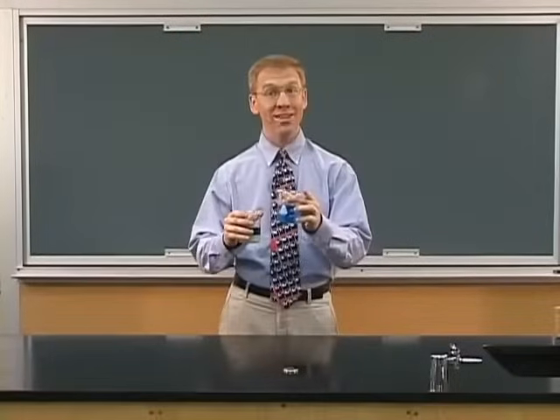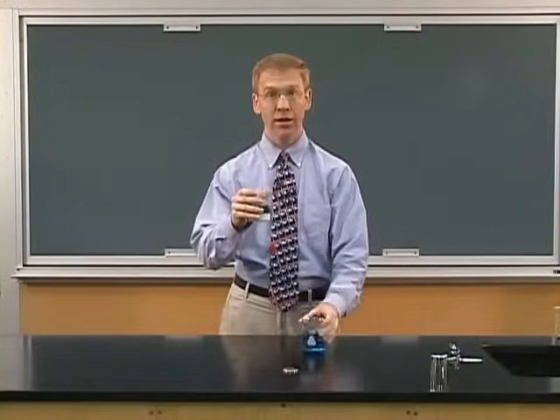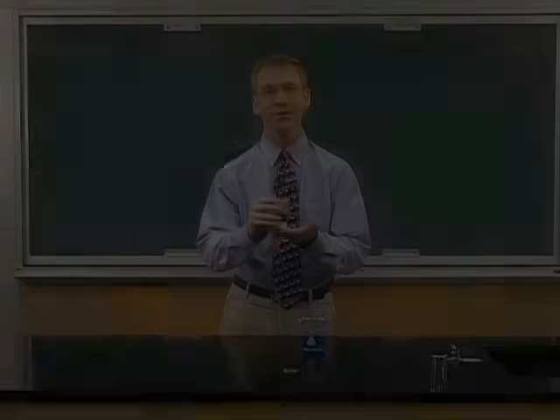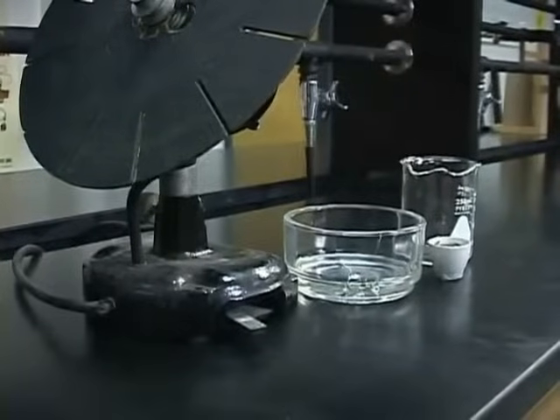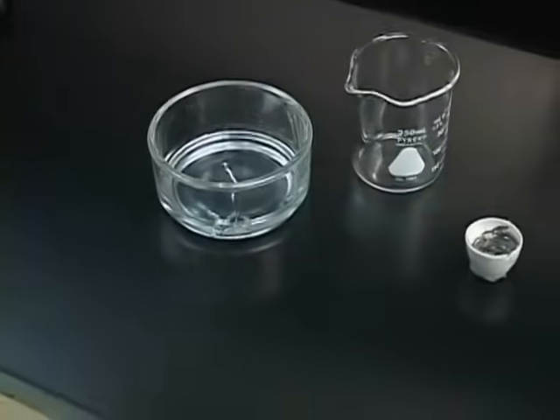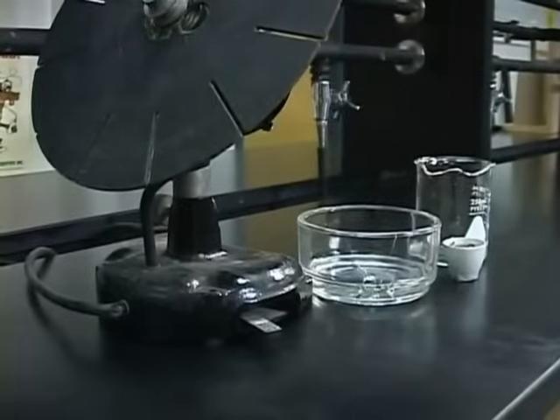Now remember, when we're in science class, you need to listen to your teacher's instructions about the handling, the transporting, and the safe disposal of chemicals. When you're in lab, always be alert for safety hazards, which can include broken and chipped glassware, as well as frayed cords. Let your teacher know if you ever see any safety hazards or concerns in lab.